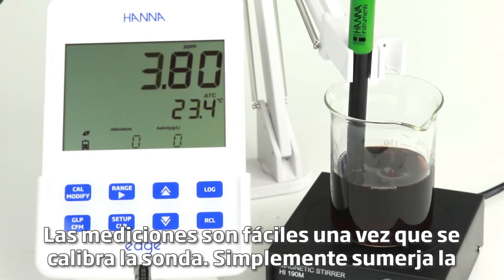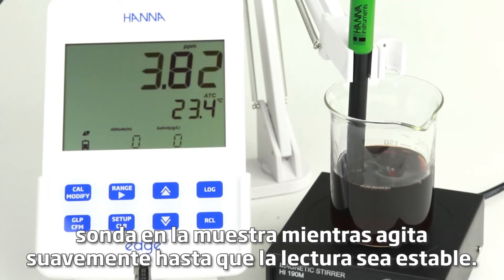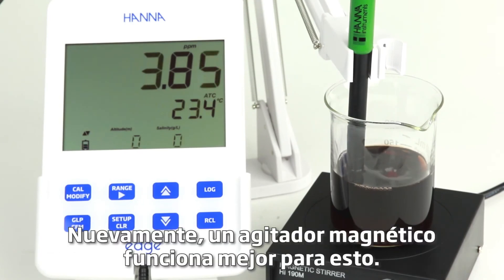Measurements are easy once the probe and calibration are complete. Simply submerge the probe into the sample while stirring gently until the reading is stable. A magnetic stirrer works best for this.